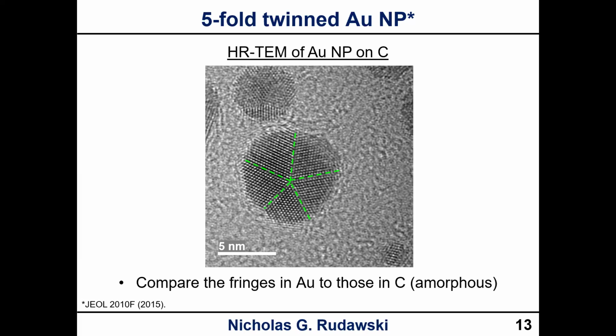That ends up happening just perfectly, because if you add up the misorientation angle between the individual grains, it turns out that it adds up basically just perfectly to 360, and so that's why you end up with this 5-fold twin structure in gold, and also in other similar materials that have a similar structure, right? Gold, of course, has the FCC structure, okay? So we can use this to directly image twin boundaries here, okay?